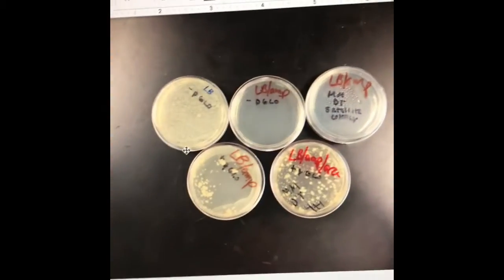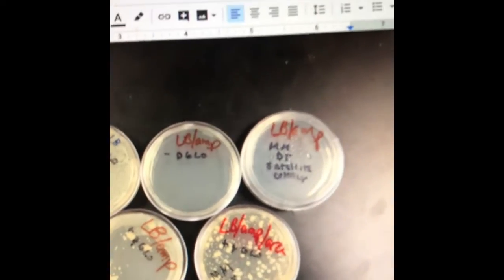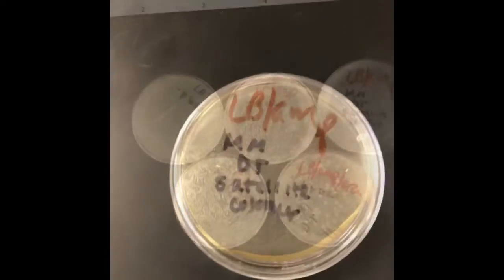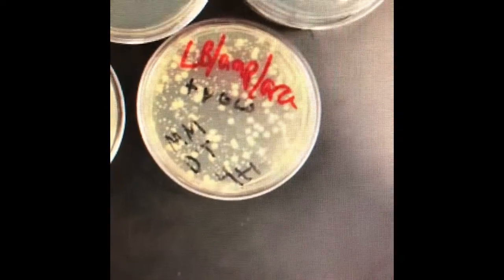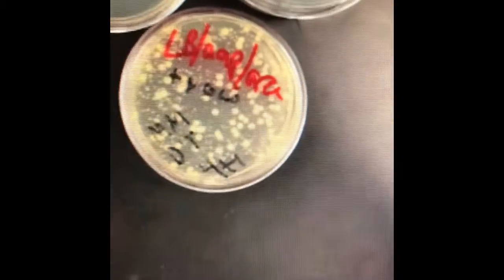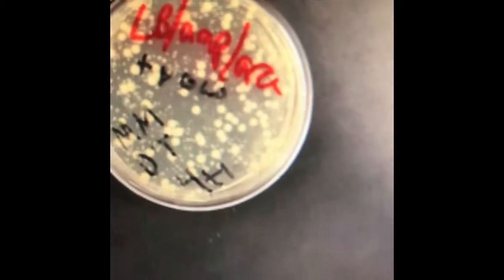These are pictures of our plates from our original experiment, and the one where we tried to grow satellite colonies was this one. And it's also right here, except much older. The plate that we got our satellite colonies from was this one that had LB, ampicillin, and arabinose with the bacterial colonies that you see here that are very visible.